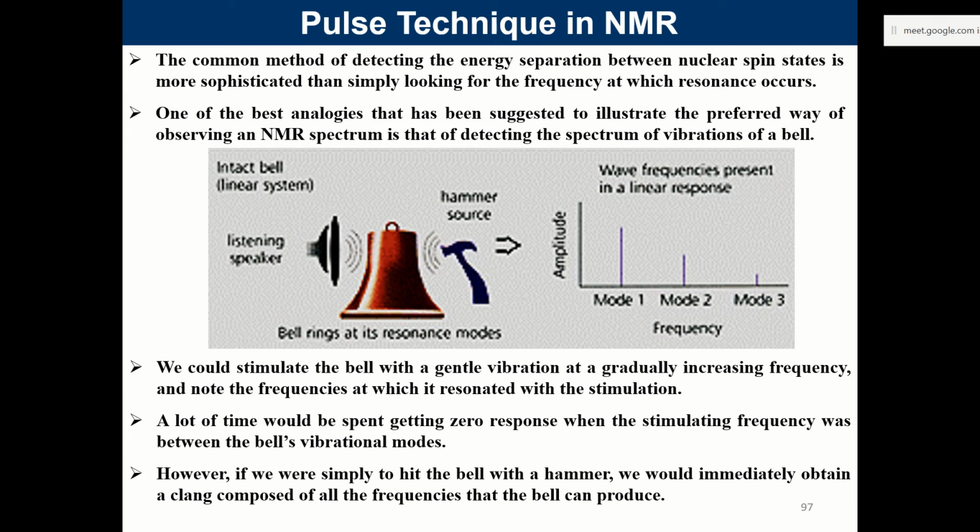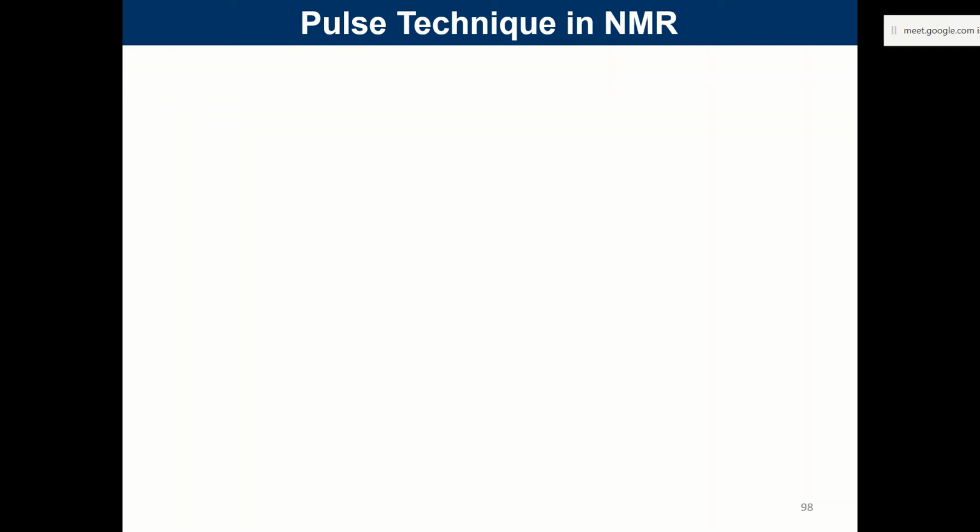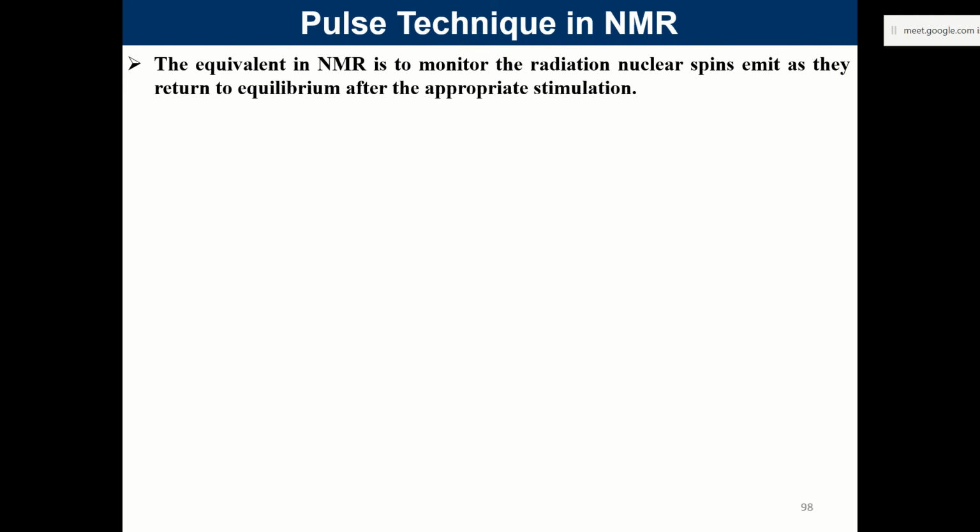Now moving ahead, putting this in the context of NMR, earlier in the initial description I told you that we apply a magnetic field, the precession starts, and there is a radio frequency field which is usually kept fixed. That's the early model that we had, and that fixed radio wave is incident upon the sample and an absorption occurs. So that was being analyzed in previous cases.